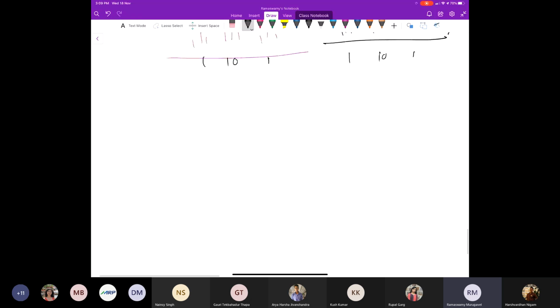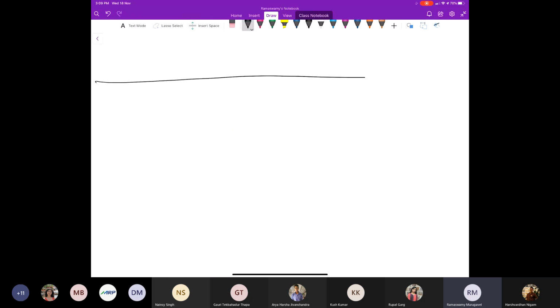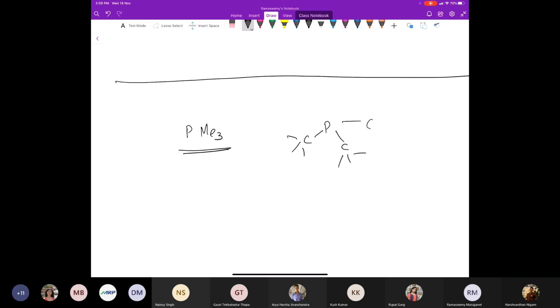Let me just continue that. In the meantime, you asked me the question. I got sidetracked. Now this PMe3 is a very interesting system. We only talked about phosphorus NMR, and forgot the PMe3. If you look at it, it's got a carbon and 3 hydrogens, right? So actually, this itself is a good NMR problem for NMR 101, not CH101. Because here you have 9 protons.